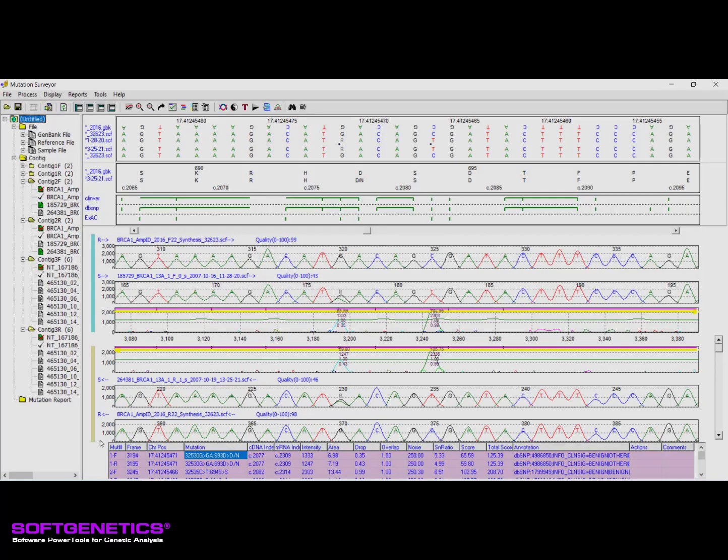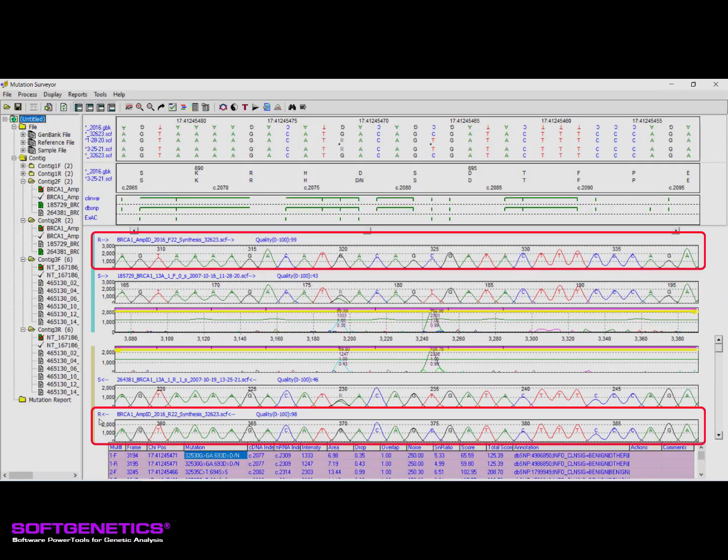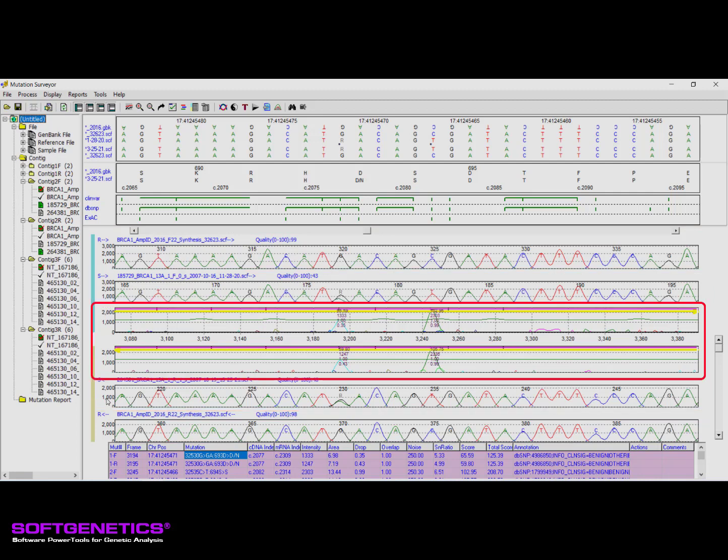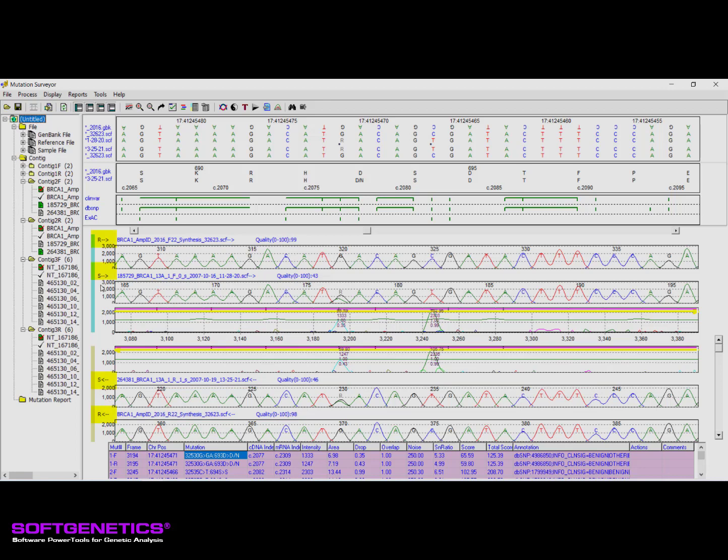The outermost traces are the reference traces, with the sample traces appearing in the middle. The innermost traces are the mutation traces. Trace type, meaning reference or sample, name, sequence direction, lane quality, and any trace comments are displayed above each trace.